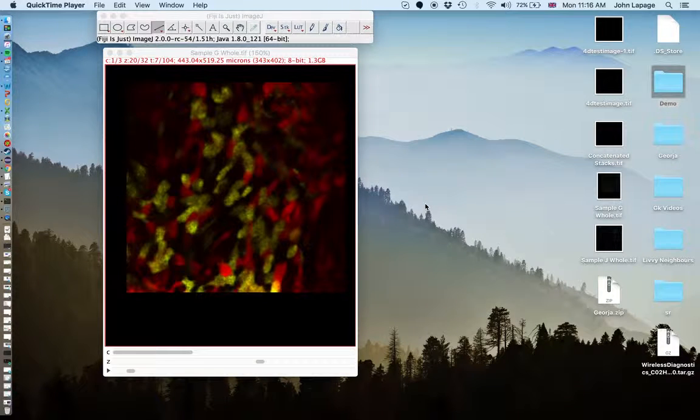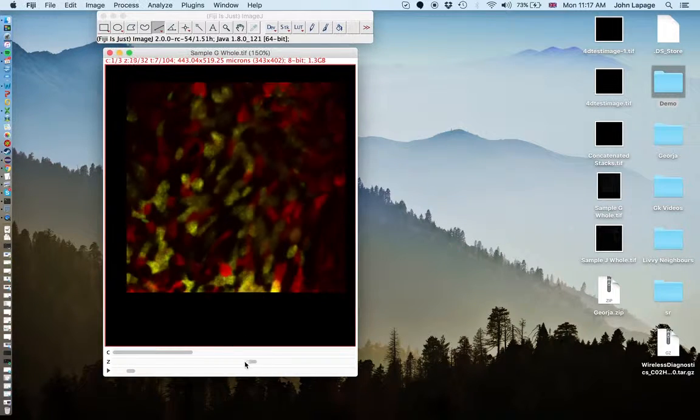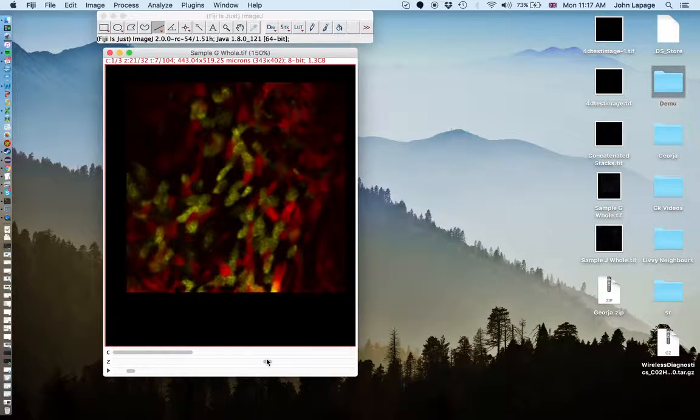Okay, let's talk about measurements. This is measurements of distance, and also we'll have measurements of cell velocity. I'll show you how to do those. This is going to be useful because you've done so much looking at these lumen, you might as well get the ability to do quantitative information about what they're doing.